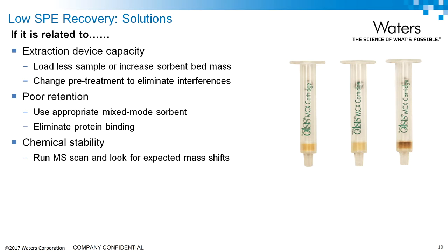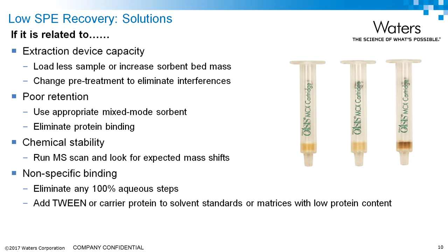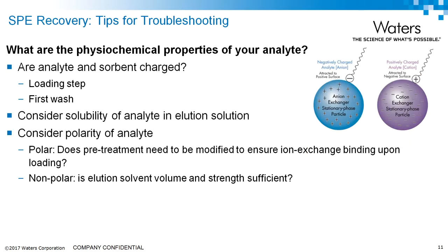For chemical stability, there are many known instabilities in amino acids resulting in known changes in m/z values. You can run an MS scan and look for expected mass shifts. Nonspecific binding is absolutely ubiquitous in protein and peptide analyses — ideally eliminate any 100% aqueous samples when dealing with stickier peptides. Adding a carrier protein is critical if you're working with solvent standards or low protein content matrices. For protein binding, if your peptide is highly bound to a plasma protein, you may need aggressive measures like denaturation or aggressive organics or modifiers.